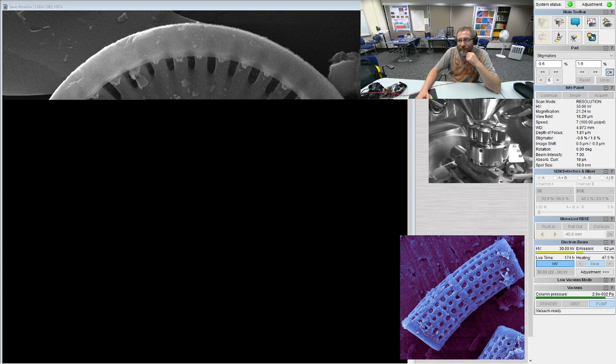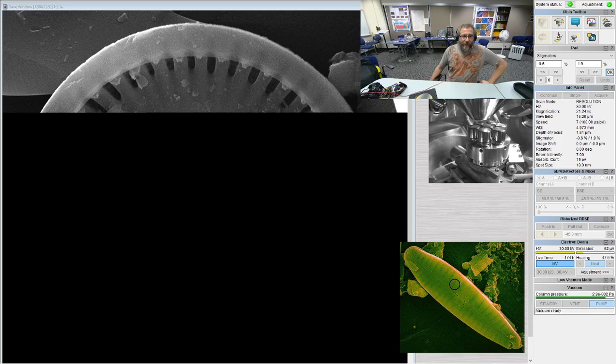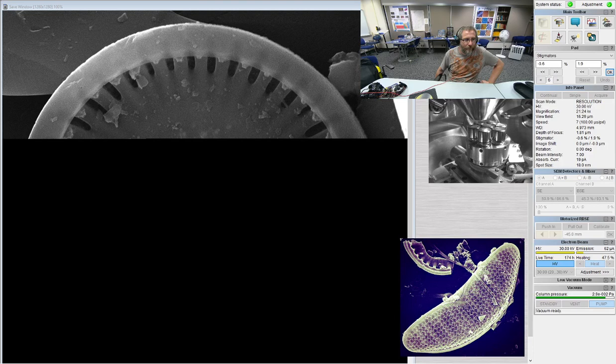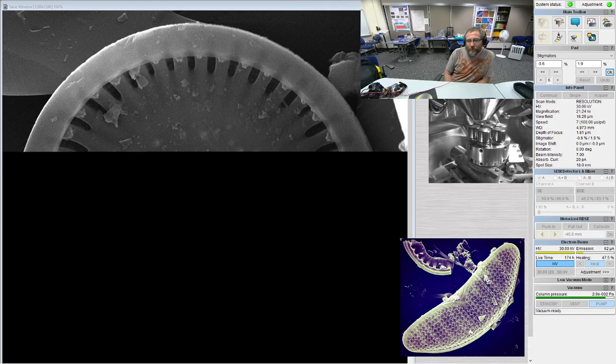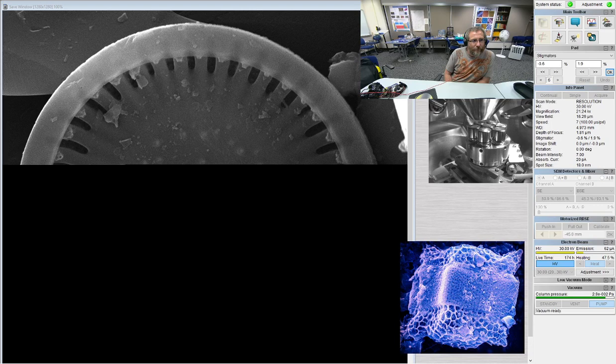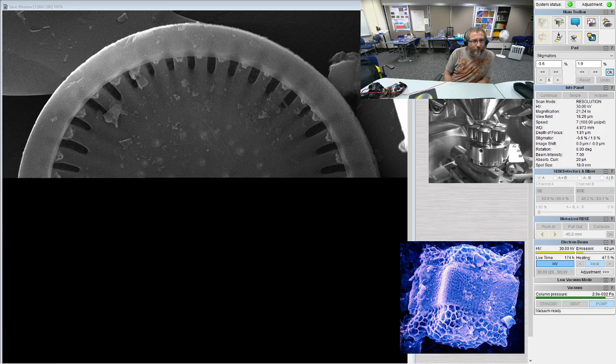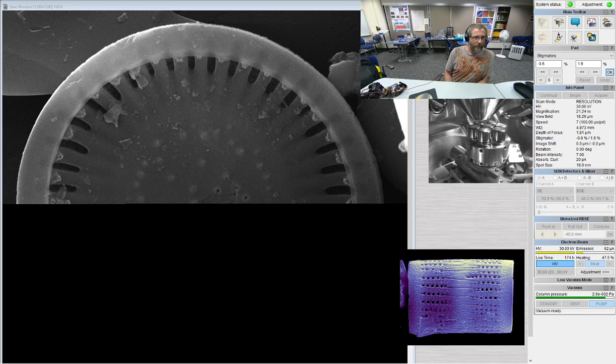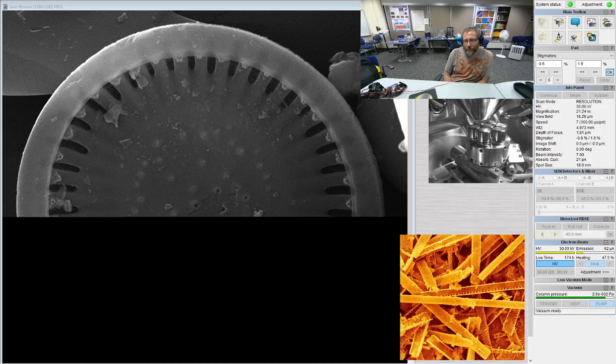What are some significant differences from 6-million-year-old fossils compared to recent water samples you found? Kind of what we're talking about. We have these features that define different groups of diatoms, and some scientists worked on separating these groups for quite a while, working with modern samples. Then we go back and look at fossils and say, well, what about this? And it doesn't really fit anywhere. But the overall shape, the overall size, those are rather similar.